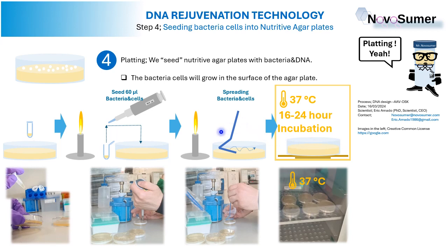So we will put this plate inside the incubation chamber at 37 Celsius degrees, and we will incubate it for 16 to 24 hours. Here you have a picture of the incubation chamber set up at 37 Celsius degrees with the agar plates inside, the agar plates with the bacteria cells, with the DNA inside.